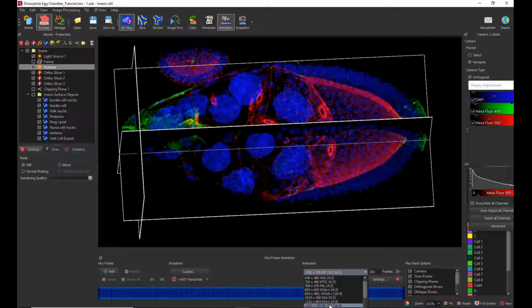If you want to play your video on one of the big screens or 16:9 screens, you pick one of the 16:9 options, and typically HD, one of the HD formats to get the highest resolution. But it's up to you. It depends where you need the video for. Obviously, the bigger the video, the more computer space it takes, and it's more heavy for PowerPoint presentations, etc. So it's really up to you, the choice.